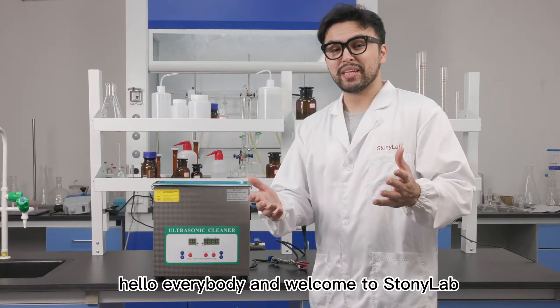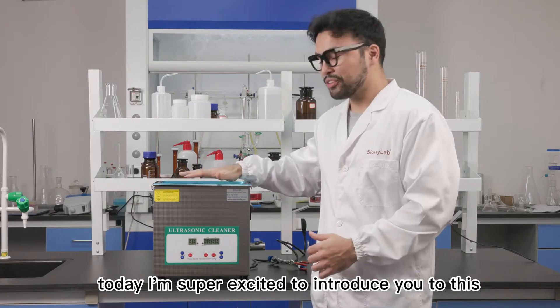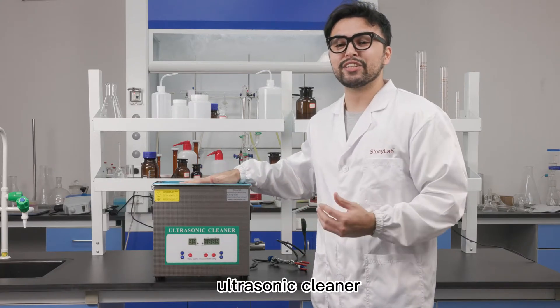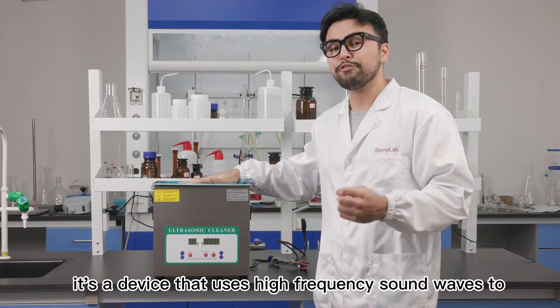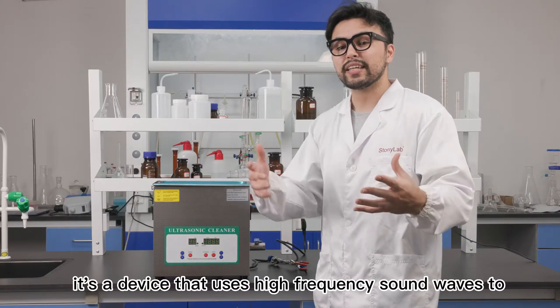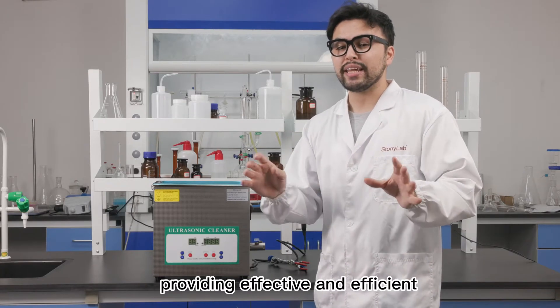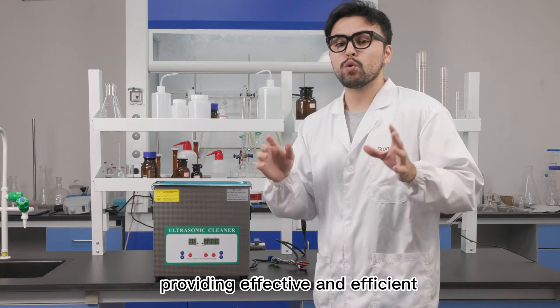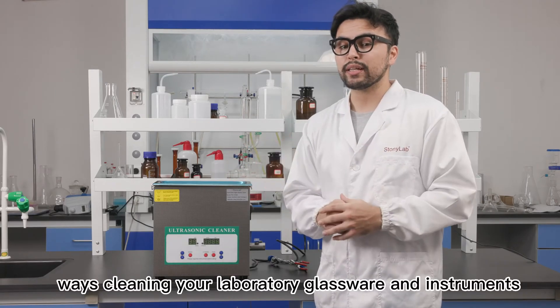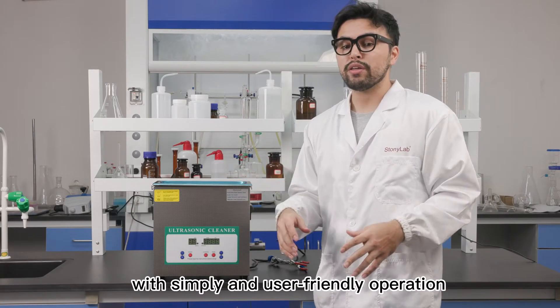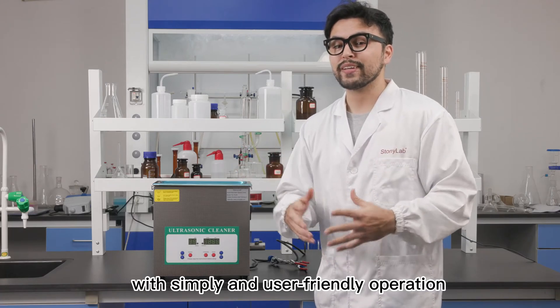Hello everybody and welcome to Stonyalab. Today I'm super excited to introduce you to this ultrasonic cleaner. It's a device that uses high-frequency sound waves to clean your items, providing effective and efficient cleaning of your laboratory glassware and instruments with simple and user-friendly operation.